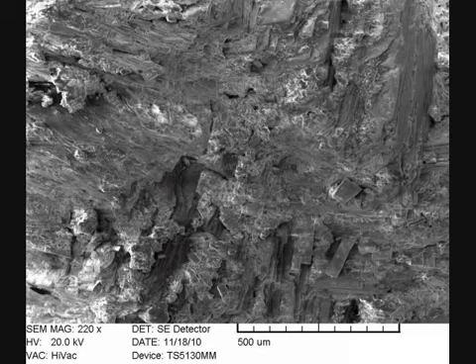You may say this is not a very high resolution for an electron microscope. That is because when you actually want to perform EDX, energy dispersive X-ray spectroscopy, you have to have the electron beam far away from the source. So this image is just a low-quality byproduct of the actual energy dispersive X-ray analysis, and it's not as good as it could be if the sample had been coated with gold and stuff. So this is just a byproduct. But it's still nice, and you can see the mineral structure quite nicely, especially on the bottom right there.